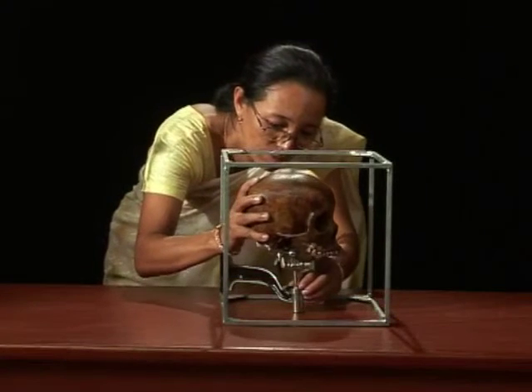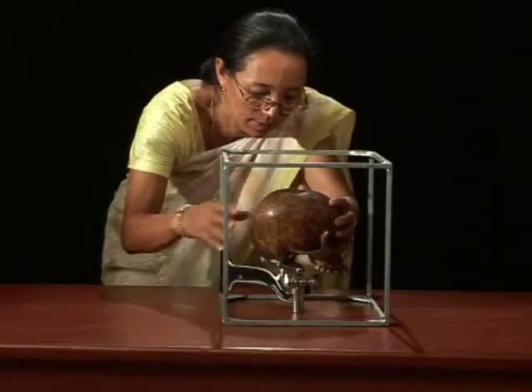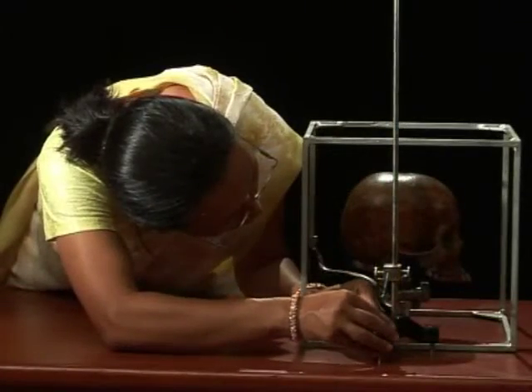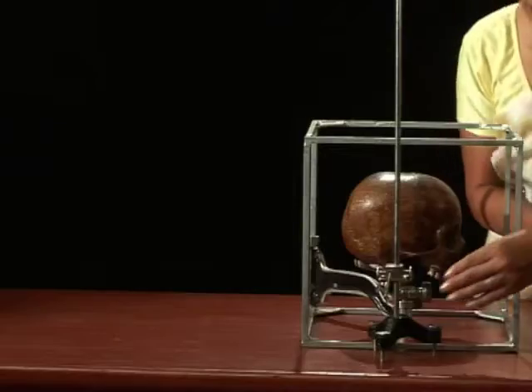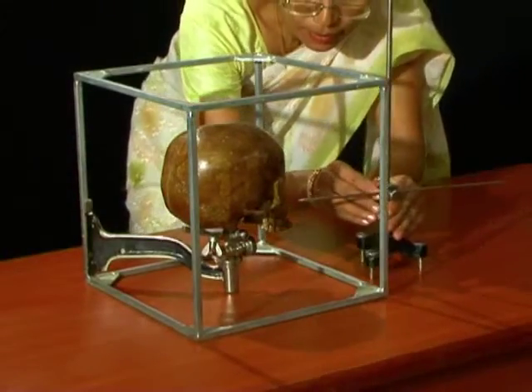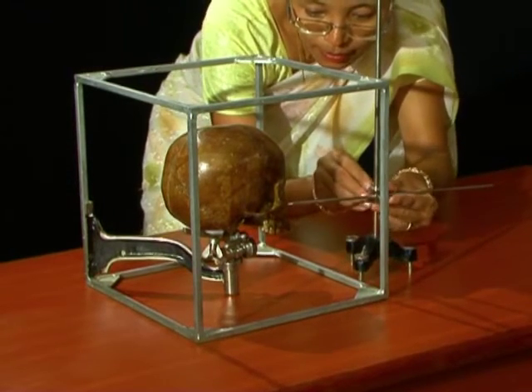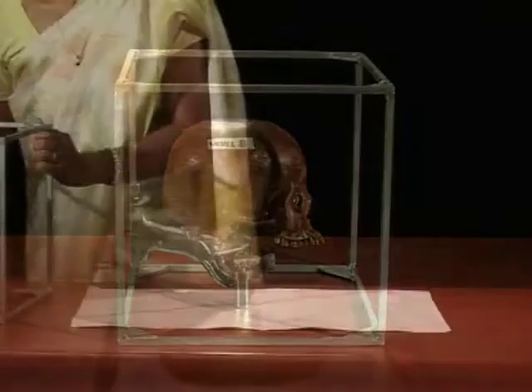For this, the skull to be craniographed is first mounted on the clamp of the cubic craniophore. With the help of Martin's horizontal needle, it is kept on an FH plane. The Nasion-Basion sagittal curve of Saller's curve system is employed for drawing the contours of the skull. As mentioned earlier, the skull is placed in a norma lateralis position.